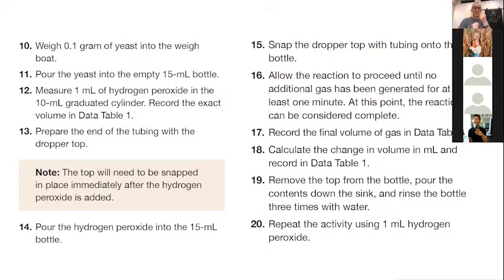The enzyme catalase works so fast that if you put twice as much in, it probably won't make any difference. The amount of catalyst isn't nearly as important as just having the catalyst there, because most catalysts work so quickly that just the tiniest amount is sufficient. We could just add a pinch of yeast and that would be fine.